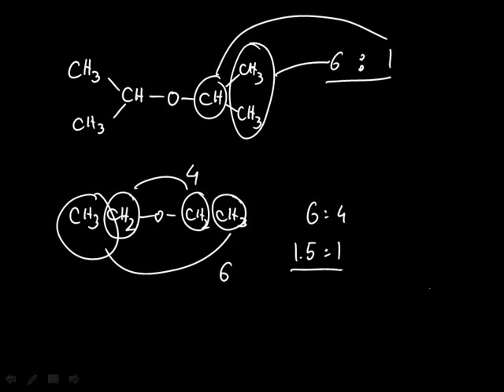The other piece of information which is much more general and comes out in a lot of other compounds is that if you have a peak with integration of 3, that oftentimes corresponds pretty unambiguously to a methyl group. And the situations where you have integration of 3 coming out for some other reason are relatively rare. And once starting with that methyl group, we can relatively easily establish the absolute numbers associated with other integrals and sort of move towards solving the structure.